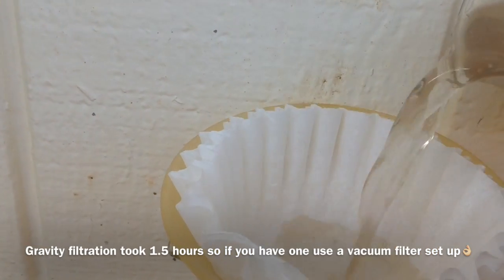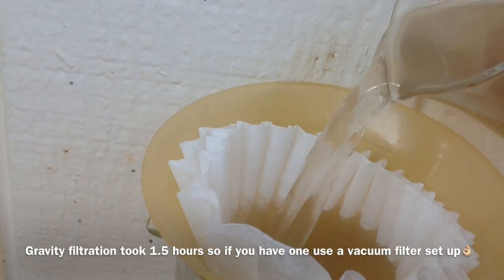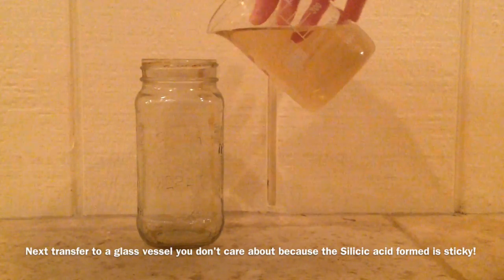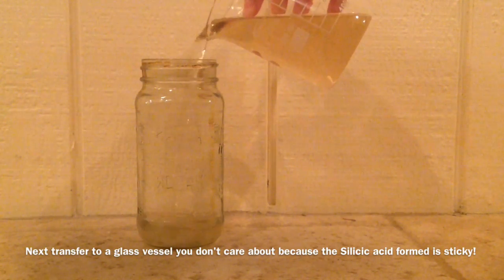Next we filter it to remove the insoluble impurities and transfer it to a vessel you don't really care about, as heating will cause the silicic acid formed to stick to the glass.